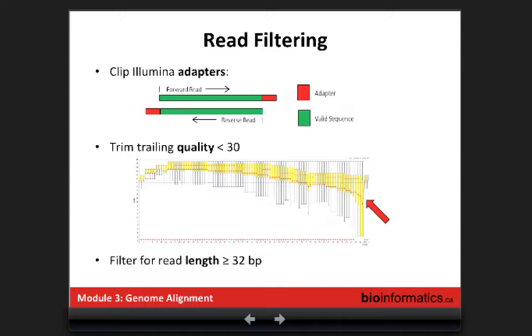Yeah. Some of your reads will have good sequences until the very end, and some of them will have poor ones. But usually you cannot go down and then up, because in most cases, if you are going down, it means that your reads are unphased. A lot of sequences in your cluster are unphased, and you cannot rephase them at the next cycle. So usually, when your quality starts to decrease, it will not become better after a few cycles. It will just become worse and worse. But it's different for every read.